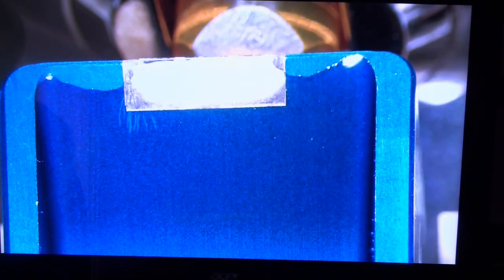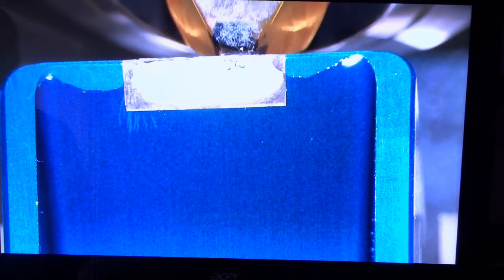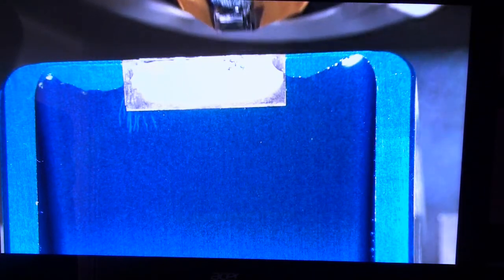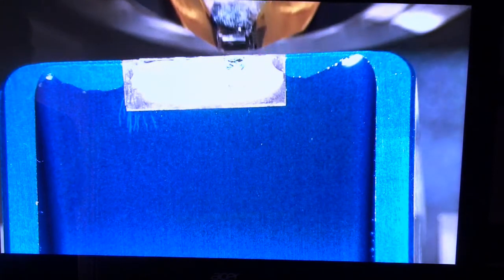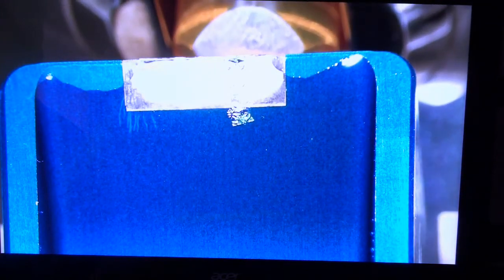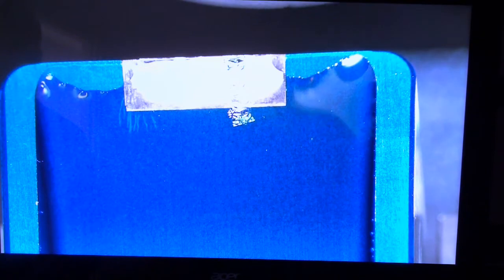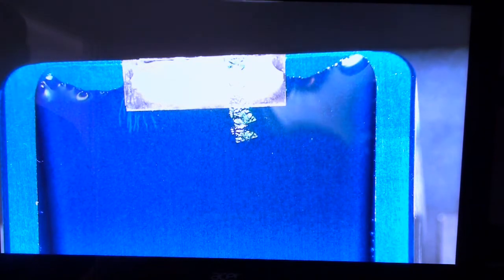And just make sure you get everything in there. And so now my alignment is all done and I'm ready to start sectioning. So I push cut and it will now advance 500 nm at a time. And there's my first full section. That reflection inhibits the colors from being able to be seen a little bit until it gets out into the far part of the water. But I'm getting good sections from top to bottom. And the sections should be transparent and look metallic. Nice and shiny. If they are cloudy and milky, then your knife is not sharp enough.